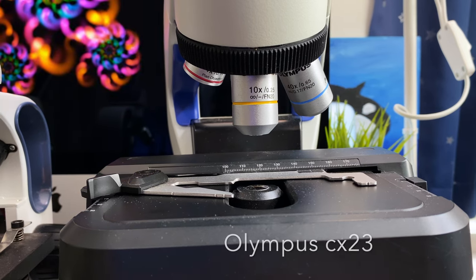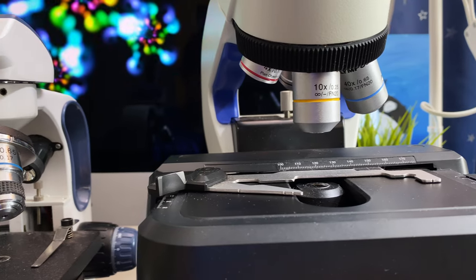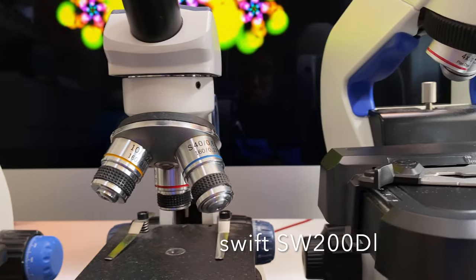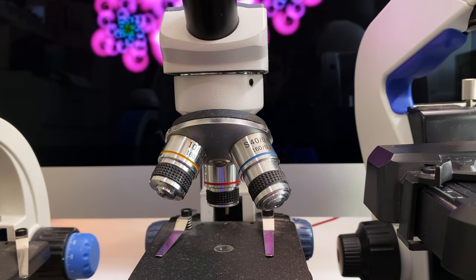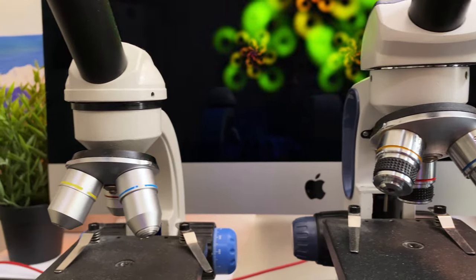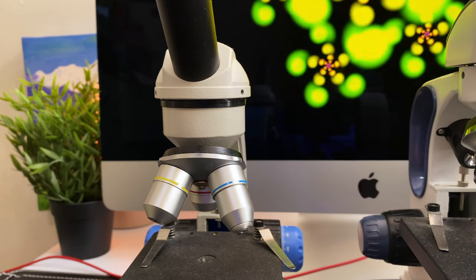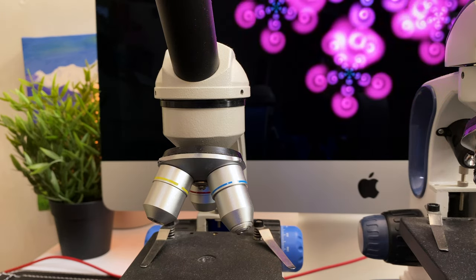Here is a comparison of the Olympus CX-23 microscope, the Swift SW200DL, and the Swift SS110. We'll compare these microscopes on price, features, and image quality. Let's talk about features.